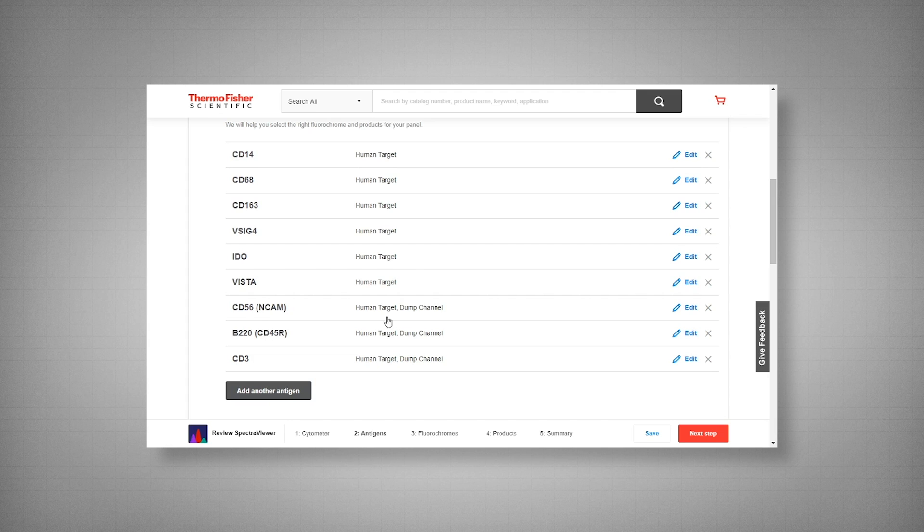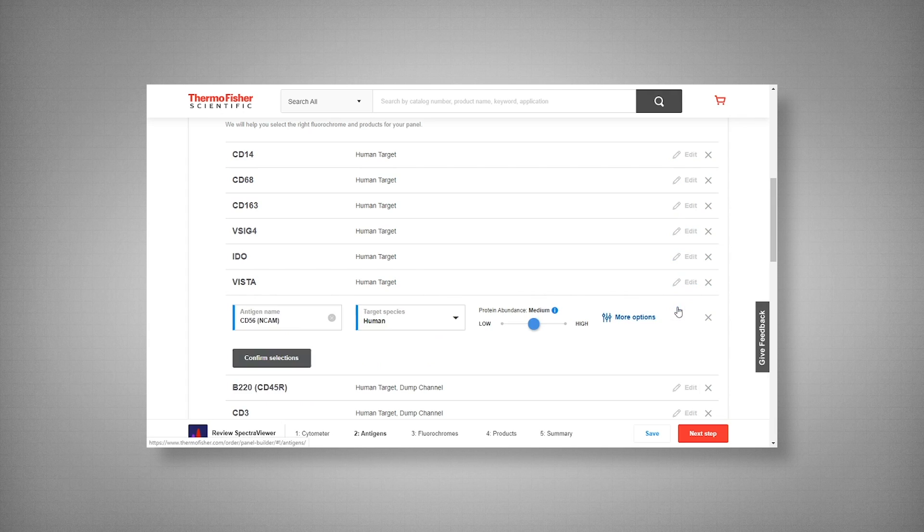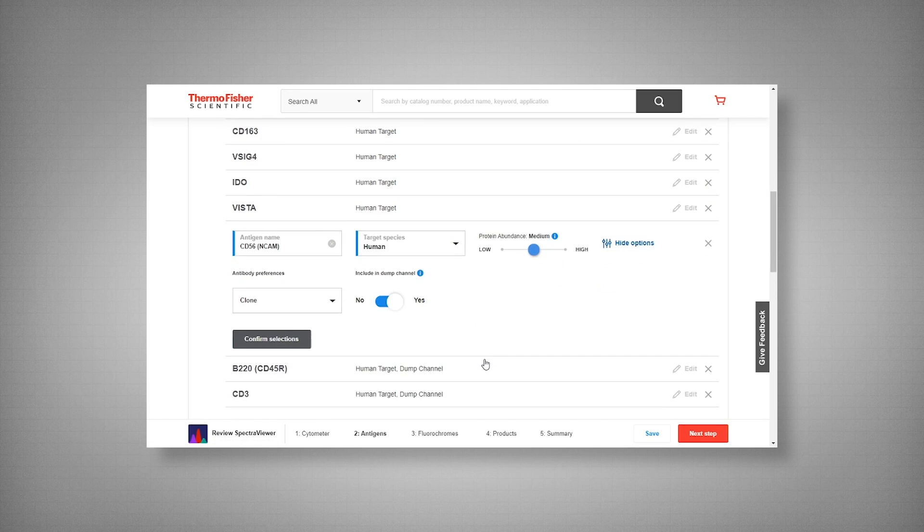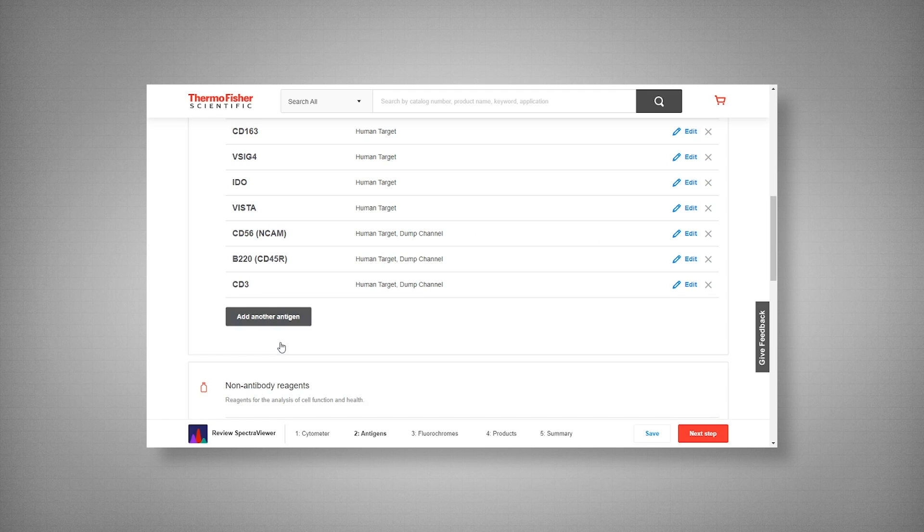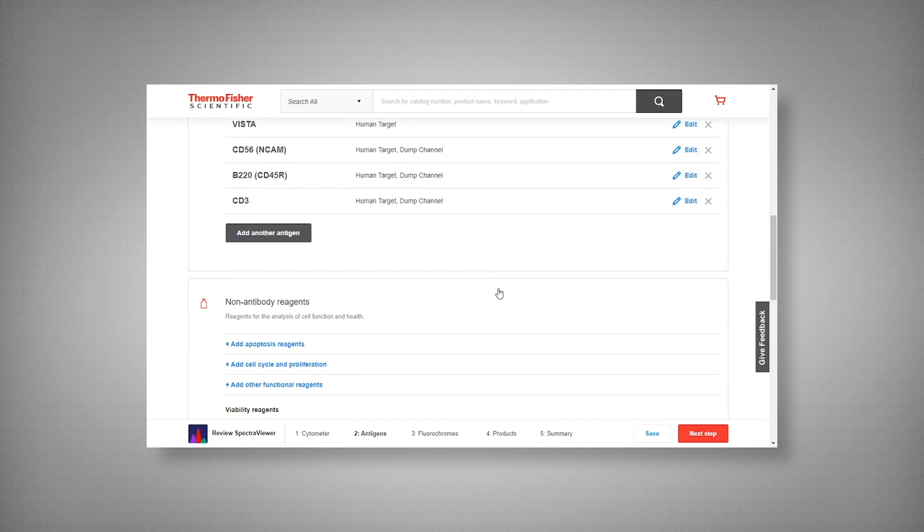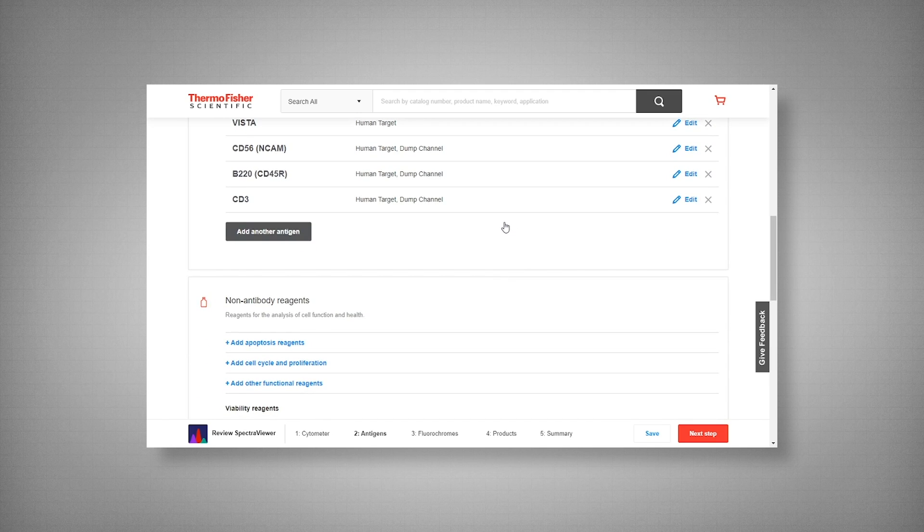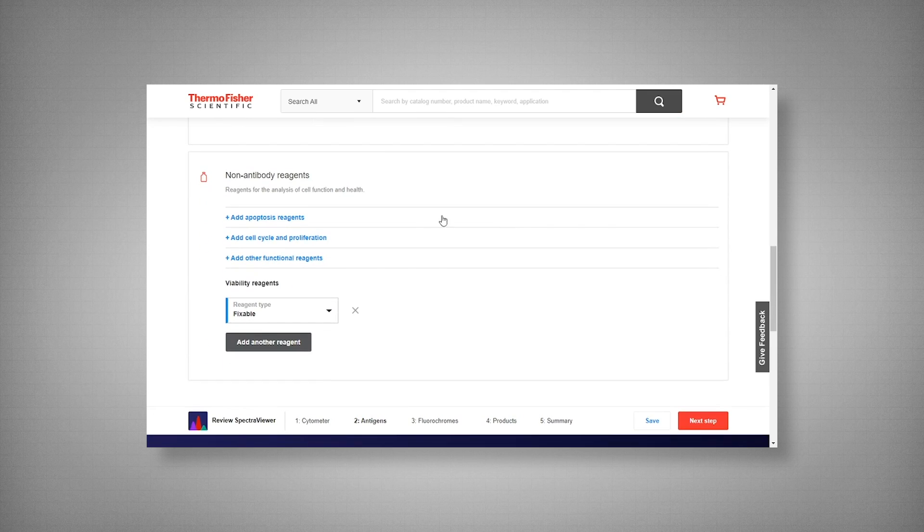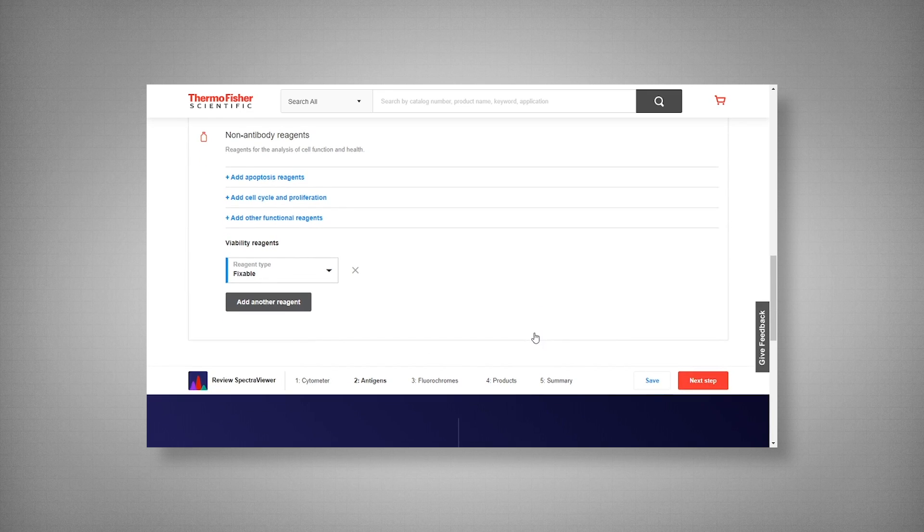Now to set your target into the dump channel, you simply go to edit, more options, and there's a yes, no toggle. Pretty simple here. Once you've said yes, I would like to include this in my dump channel, you go ahead and confirm your selection. And move on to the next step, which is adding your non-antibody reagents. And here I will be using a fixed viability dye.